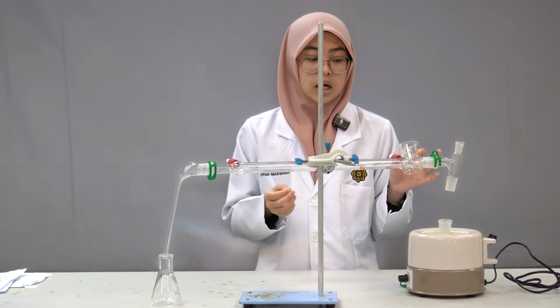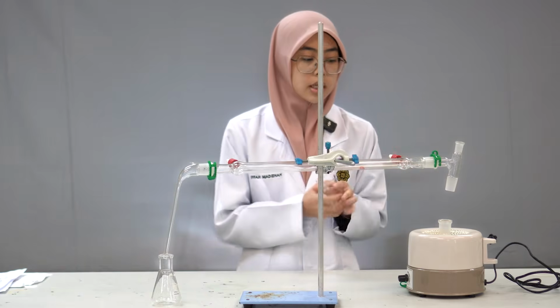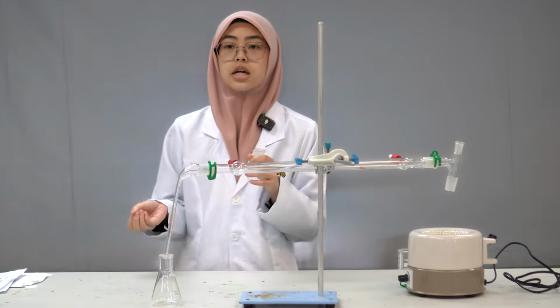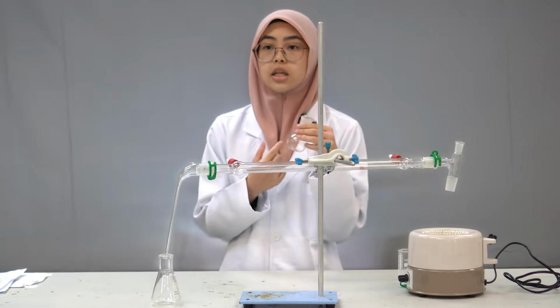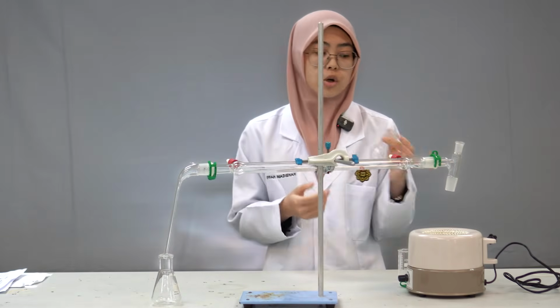And then the remaining liquid we will put into the round bottom flask. And in the round bottom flask, we will add a bit of boiling stone. The function of the boiling stone is to heat the liquid evenly in this round bottom flask. So this is the next precaution.